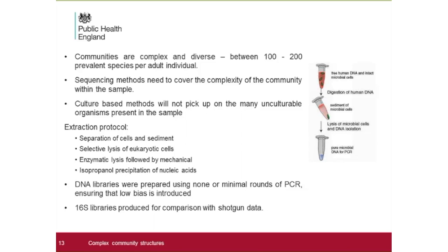Having said that, I will show you in the next set of slides that how you process the sample before lysis is more important than which methodology you plan to use.